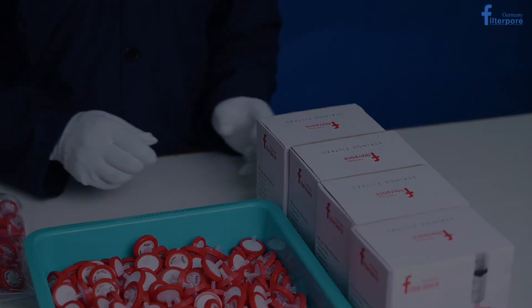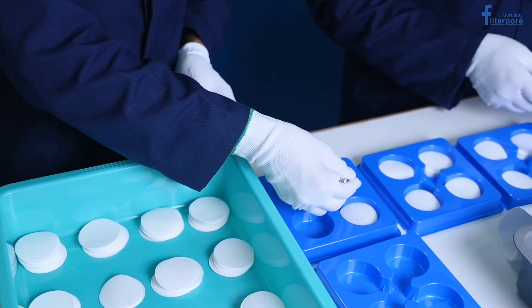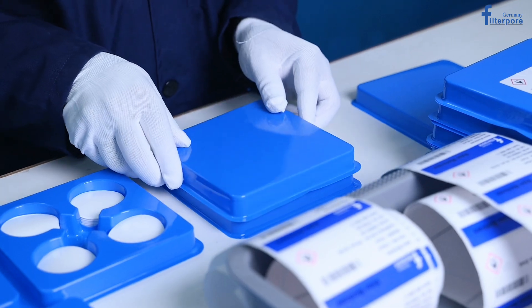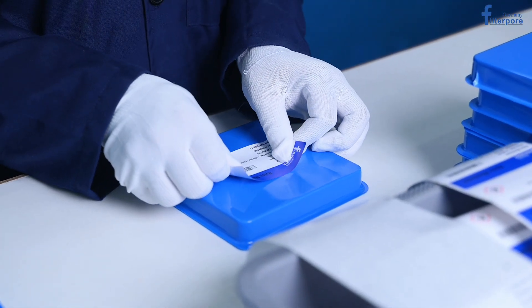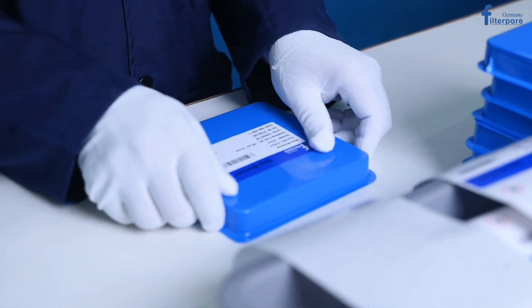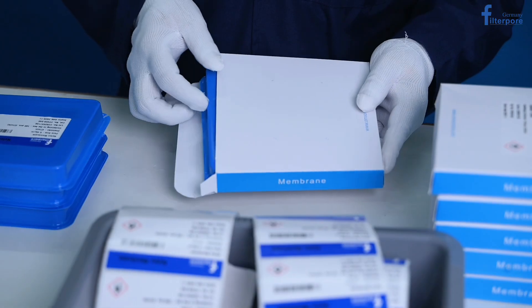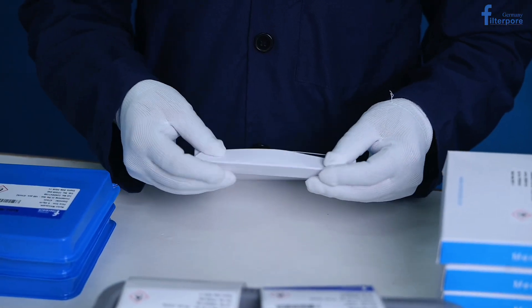FilterPour presents high-quality syringe filters and membranes, designed to simplify liquid purification and deliver unmatched performance across industries.